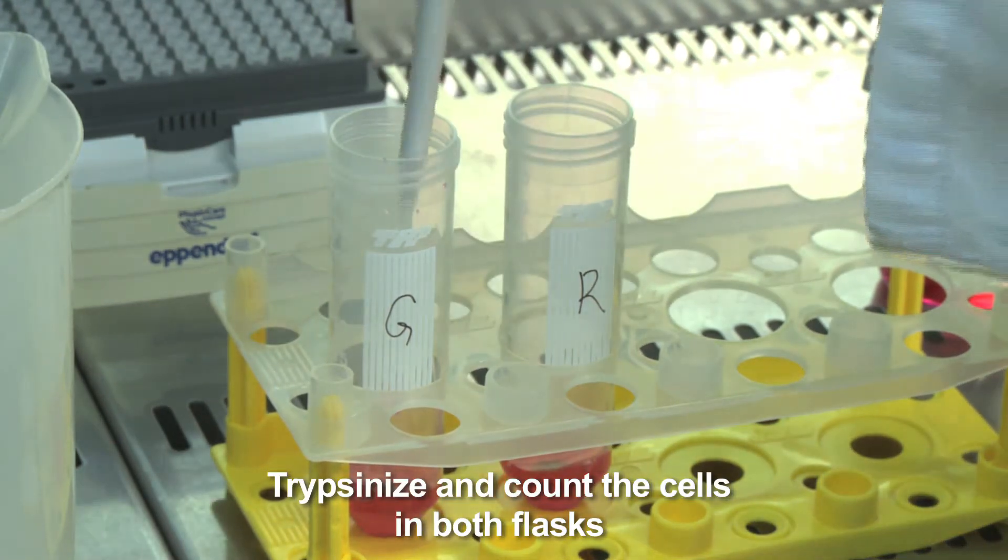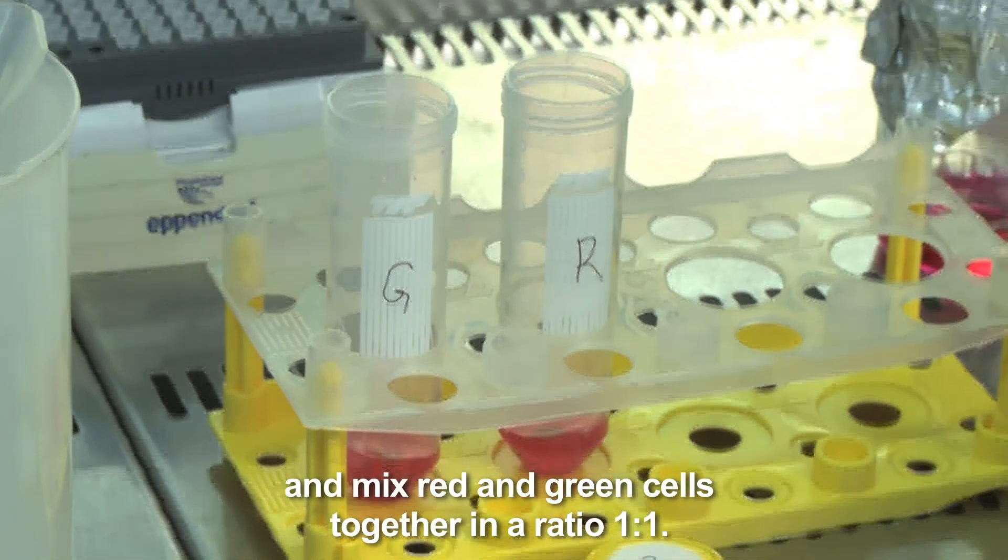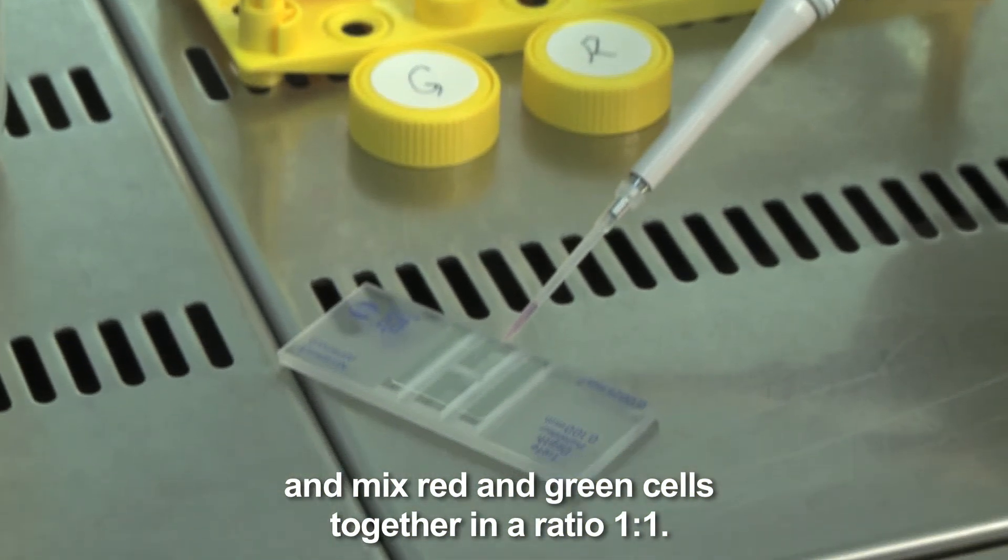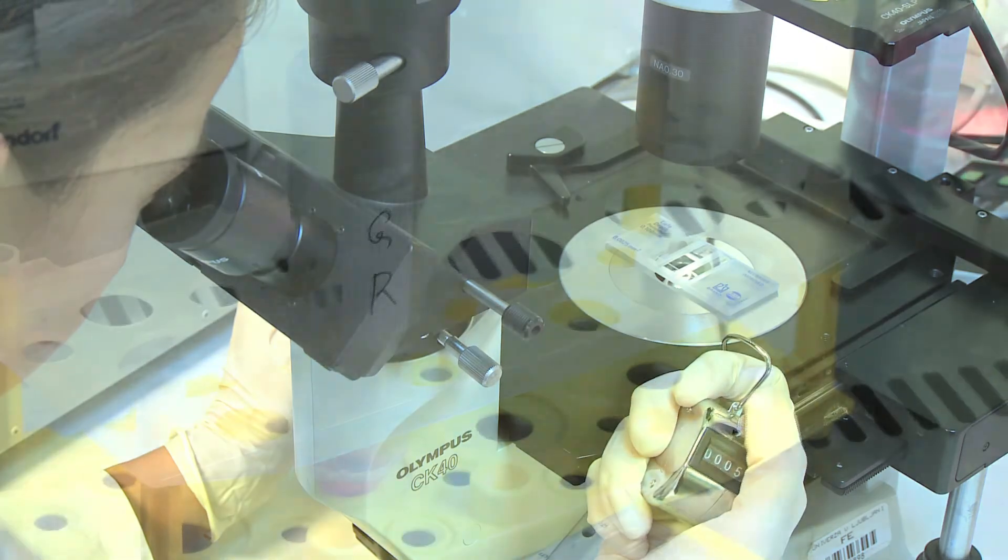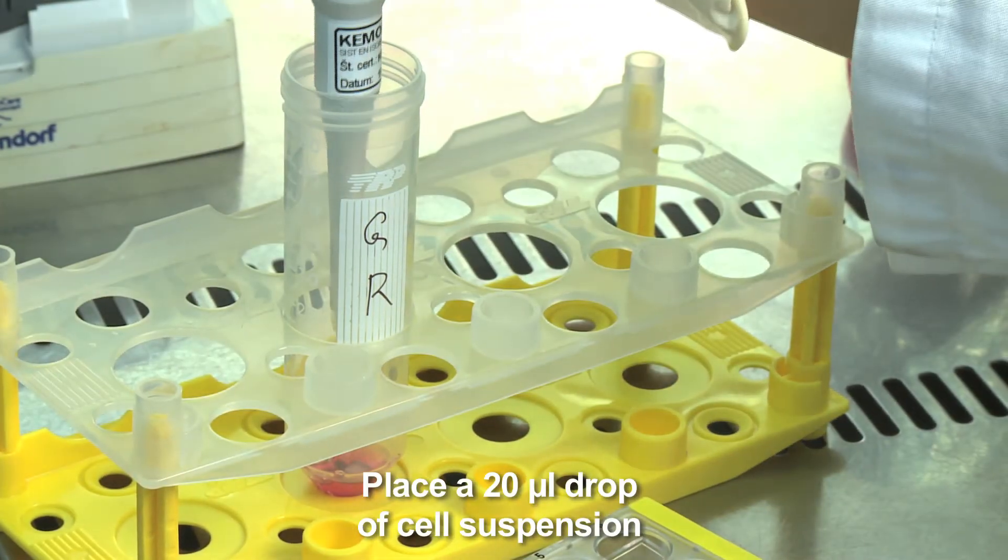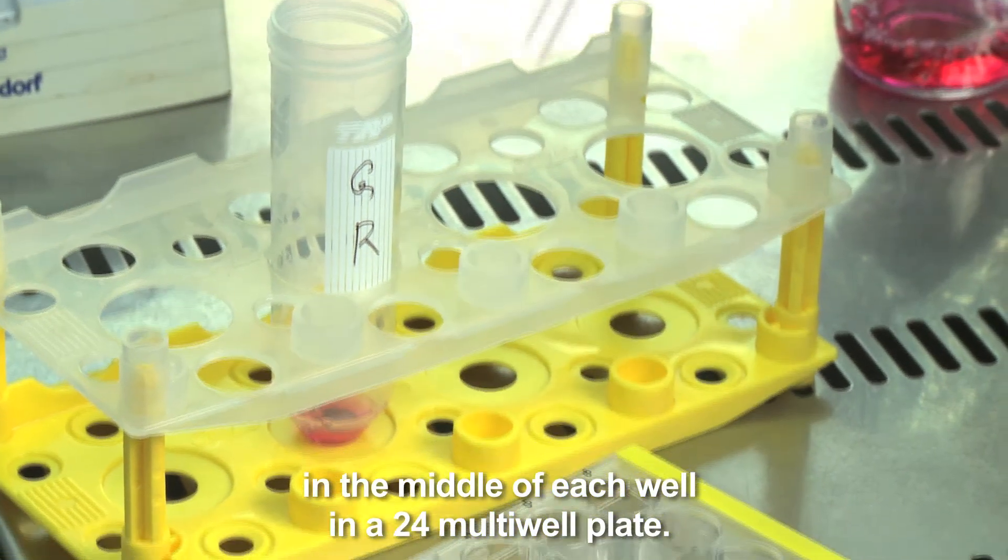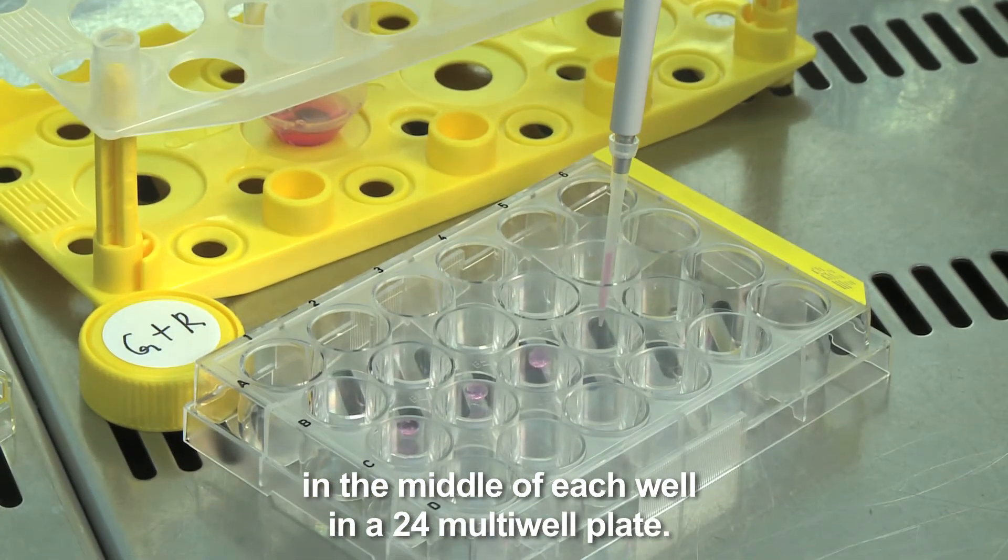Trypsinize and count the cells in both flasks and mix red and green cells together in a ratio 1 to 1. Adjust cell concentration to 5 million cells per milliliter. Place a 20 microliter drop of cell suspension in the middle of each well in a 24-multiwell plate.